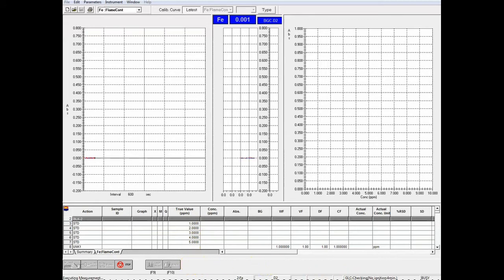You'll notice down here on the bottom, GLC, that's our gas leak check. Okay, so it's still checking, and it says no ignition for 4 minutes. So that means we can't light the flame yet. It won't allow you to light the flame until the gas leak check is done. So after 4 minutes, then we can light the flame. So we will wait for that to finish.